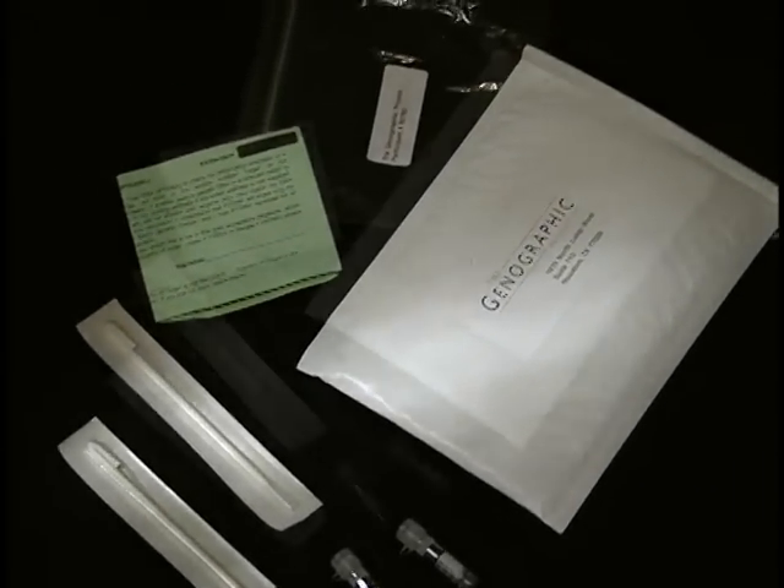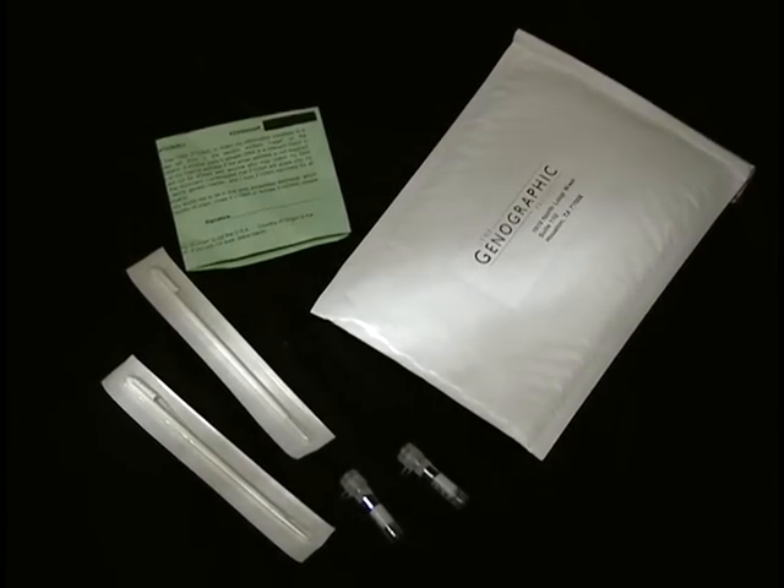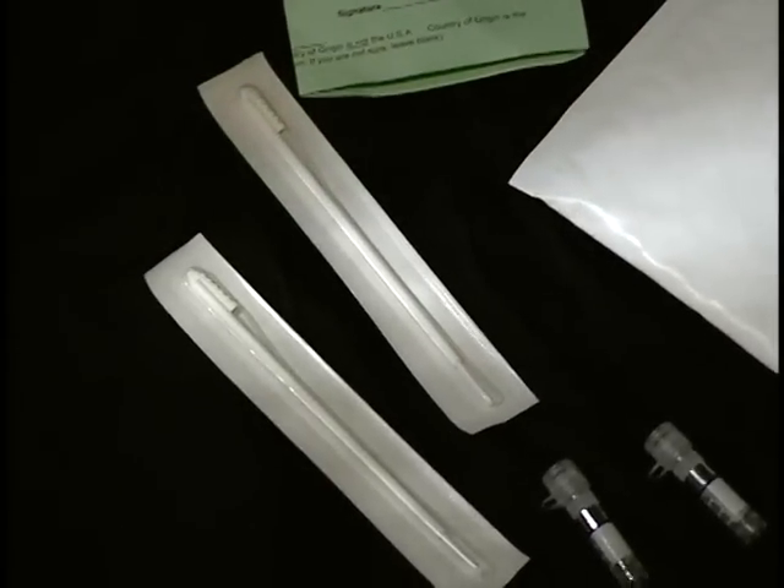Hi, I'm Dr. Spencer Wells. Thank you for purchasing the Genographic Participation Kit and for joining us on this remarkable journey. I'm here to help you use this kit and collect your DNA sample. This is the first step for you to learn about your deep ancestry, and if you choose, to contribute to the Genographic Virtual Museum of Human History.